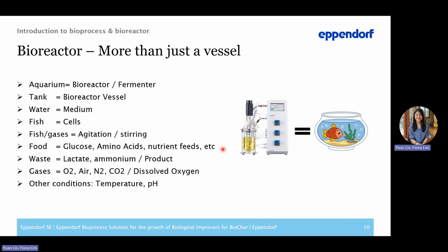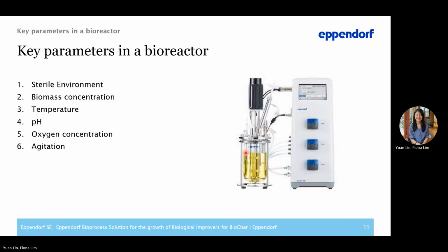Other conditions include the temperature of the water or media, as well as the pH condition that is being supplied to the cells.